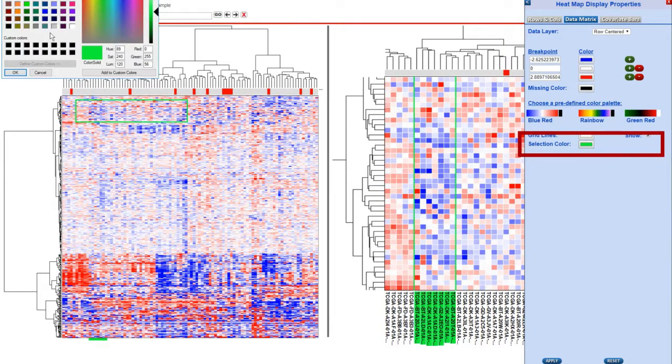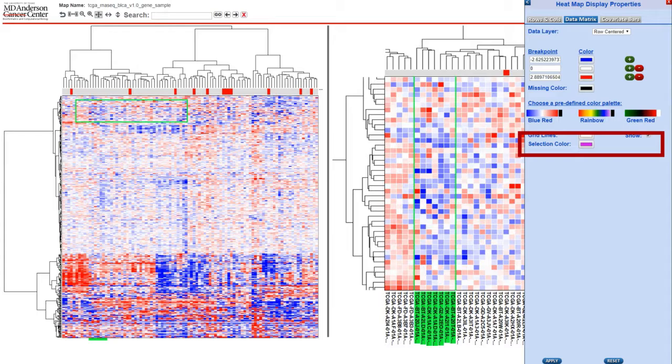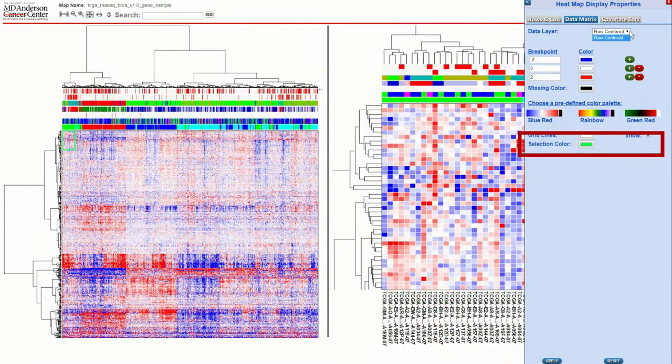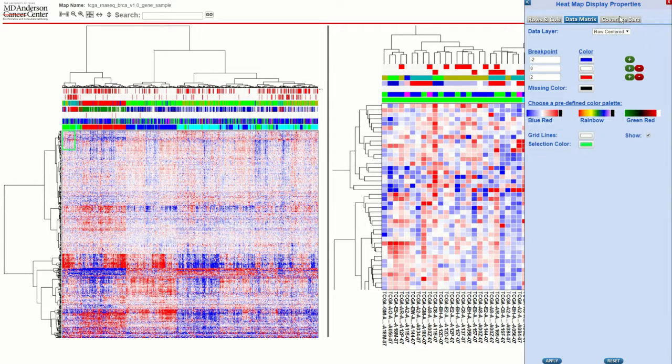If you do want grid lines shown but the current grid color does not contrast well with the colors you selected in your heatmap, you can change the color here. You can also change the selection color. This is the color of the square drawn in the heatmap as well as the highlighted color for the labels of selected rows or columns.